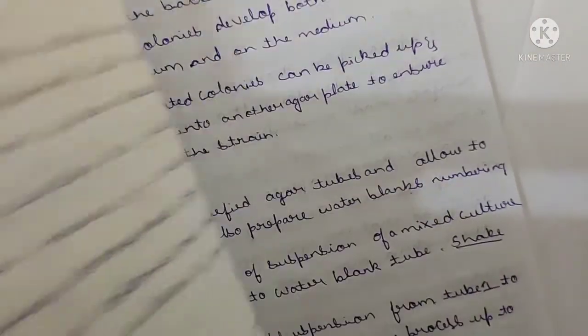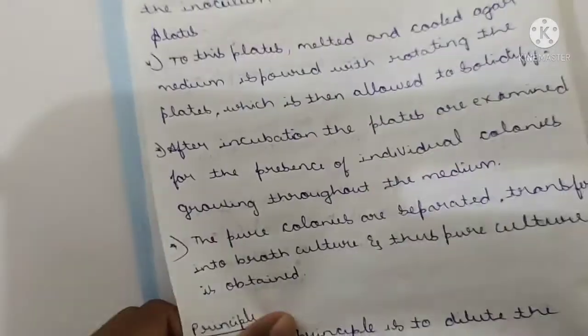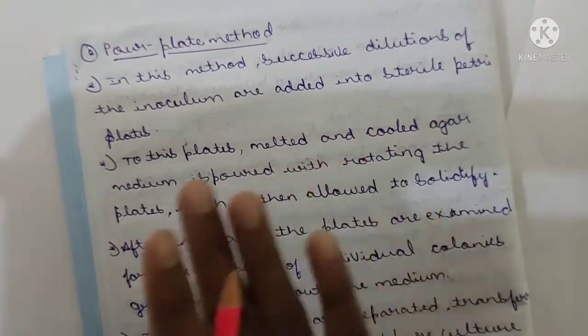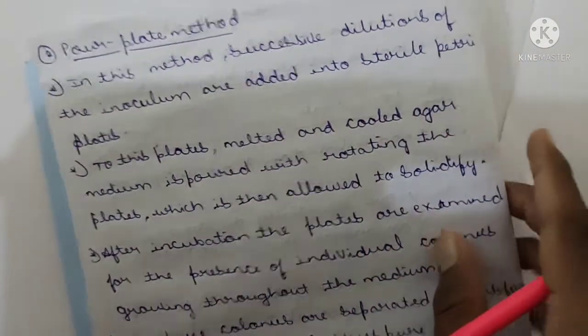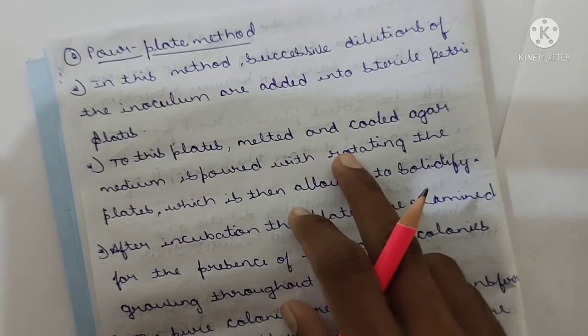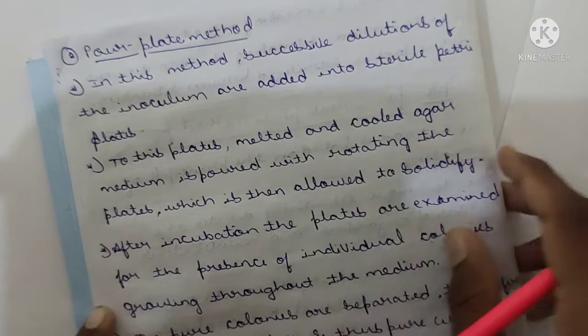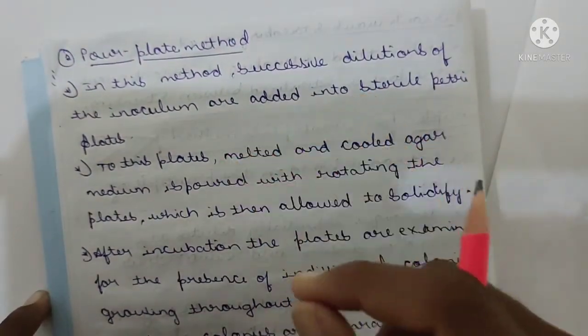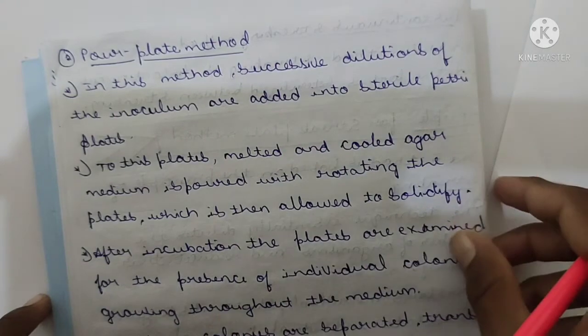Yes, my dears. Now let's discuss the second method, the pour plate method. One of the very important methods among all is the pour plate method. One more is the spread plate method, later we will discuss. Let's study what this pour is, the name itself indicates pouring.